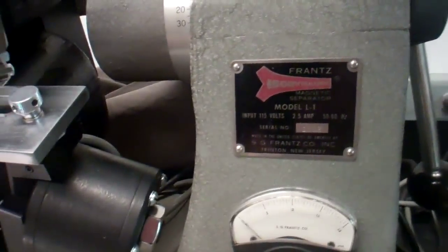Franz. Welcome to Franzing. Hello. So I'm back, and we are done with the magnetic separation of Franz. Franz, by the way, is the magnetic separator. His name is Franz. That's why I call him Franz. Anyway, hey, this is really neat.